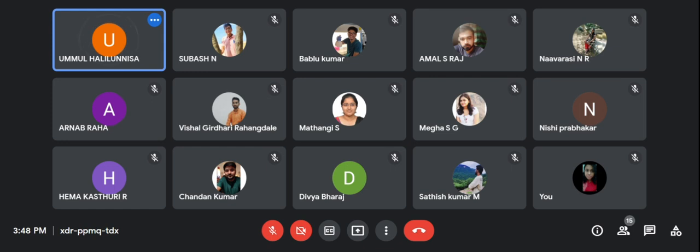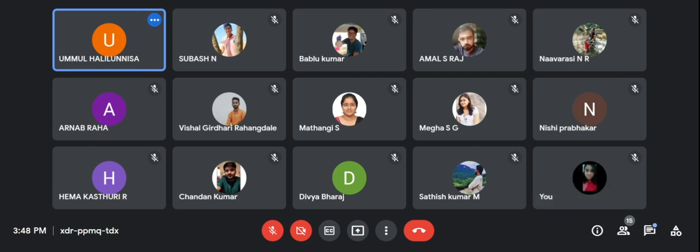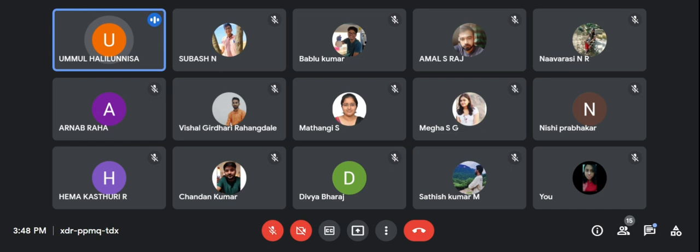One second. We are performing MEME, MAST, ProSite scan, and PRATT. Okay.